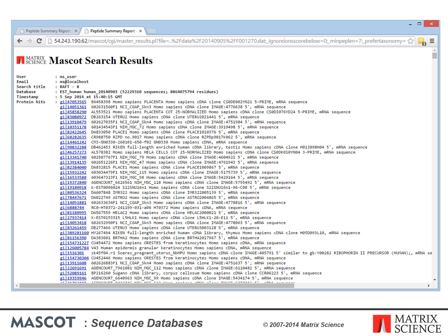With EST human, we obtained a very similar set of peptide matches. However, look at the hit list. Unlike the protein database search, it doesn't immediately communicate which proteins have been found. I'll return to this issue later.